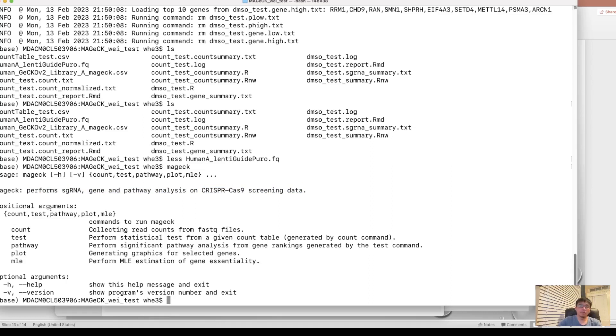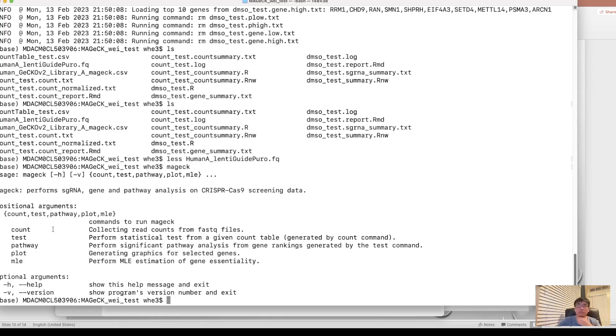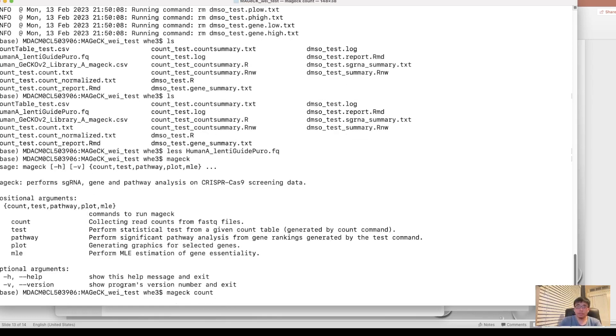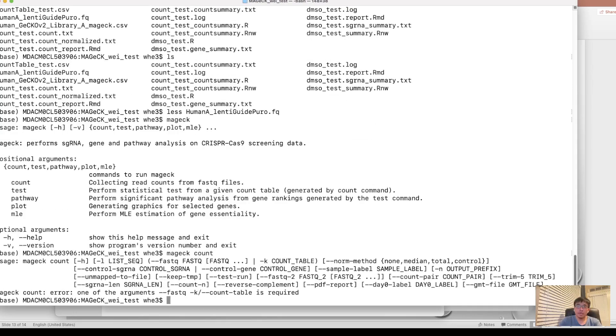And it contains five functional modules. We mainly use the count and test. Count is to map the read count of each sgRNA to the fastq file. To mapping the sgRNAs to the fastq file and get the read count for each sgRNA. And this is mainly the first step we need to do. Let's go with the count. Let's see what's the parameters.